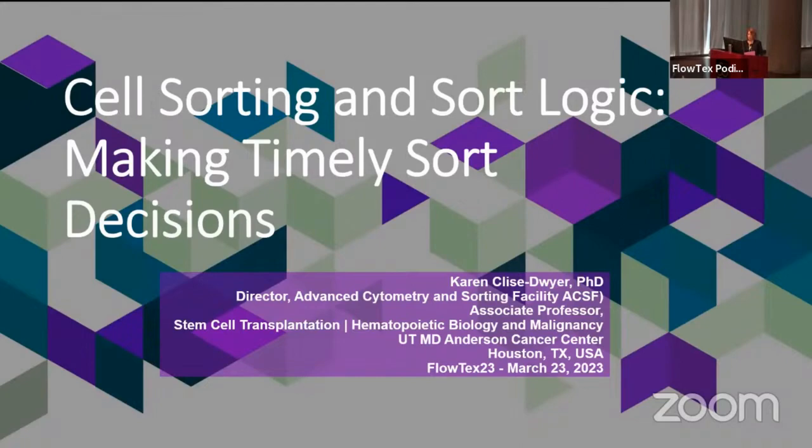Anyway, I had a talk, as Sarah mentioned, last year about cell sorting. My core lab does cell sorting for scientists across the entire spectrum of cancer research and other types of research at MD Anderson, and we sort all kinds of different cells. I've seen a lot of things that people don't consider up front that impact their sort product and their sort results. And if you don't consider the problems that you might run into up front, as we all know, you're going to run into those problems and you're going to redo your experiments.